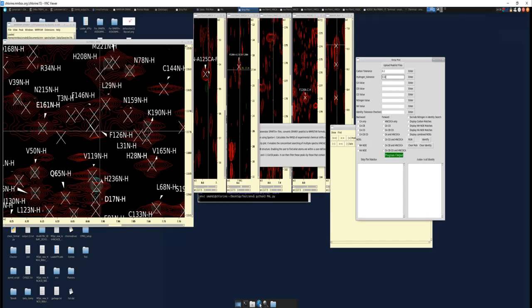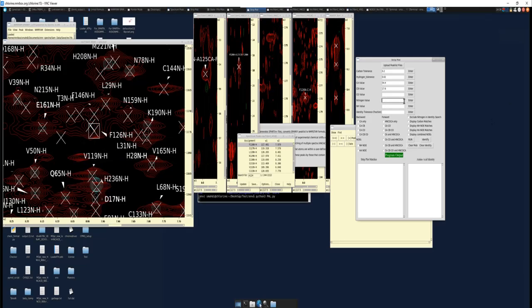So now you input your values. For the C alpha, you do 54.4. For the C beta here, you would do 17.6. And this nitrogen value is incredibly important as well: 117.481. This program works on a filter system, and that's why this nitrogen is incredibly important. It will search each of these strips. It will locate peaks that have the same nitrogen value, and you will only have peaks that have the same nitrogen value that correspond to this amide.